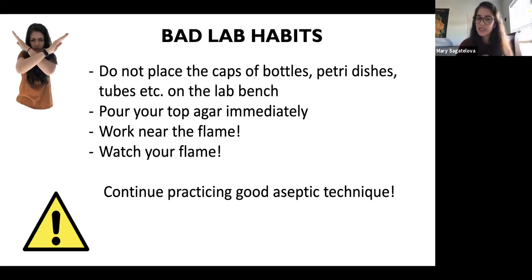So we're going to really make sure we get rid of them, especially for things that are communal. So the top agar bottles, the bacteria bottles, they are communal. If you are contaminating them when you're using them, you're contaminating them for everyone. So keep that in mind. Again, you're going to pour your top agar immediately. Make sure you're working near the flame. I see a lot of people having the flame on and they think they're near it, but you've got to be able to feel that heat. If you don't feel the heat, you've got to work closer, okay?